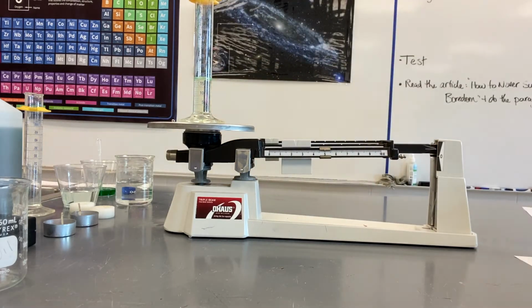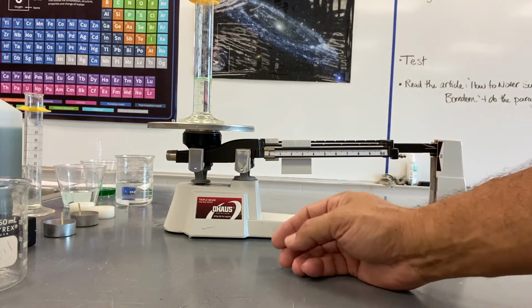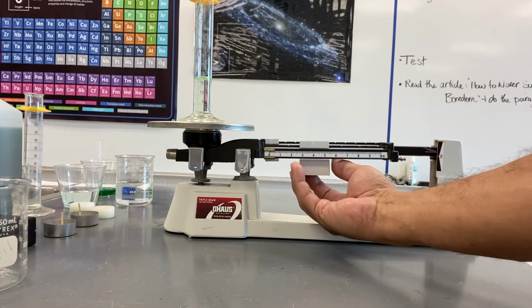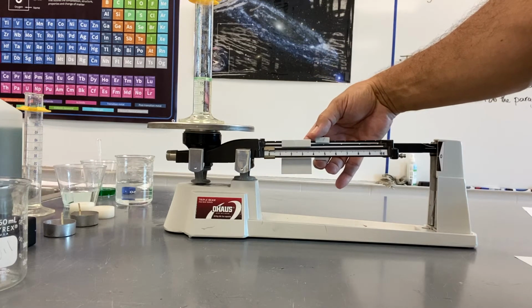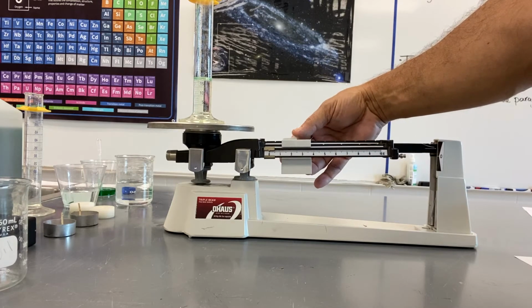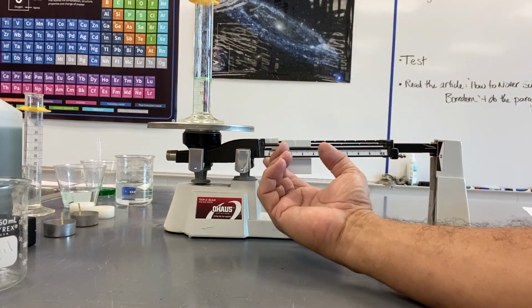I had not reset the scale, so you saw that the scale just tipped when I set that on there. So you can make some thoughts about that, some conclusions about that. So here we are at 100. I don't think we can go to 200, but let's see what happens. Nah, way too much. So back to 100. Let's try our tens unit here. Can we go to 50? Too much. 30, too much. 20 is too much. Even 10's too much. Okay. So let's try our ones here.